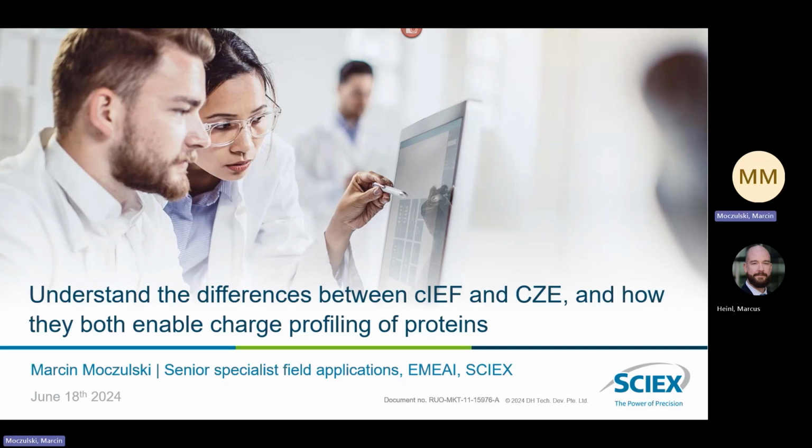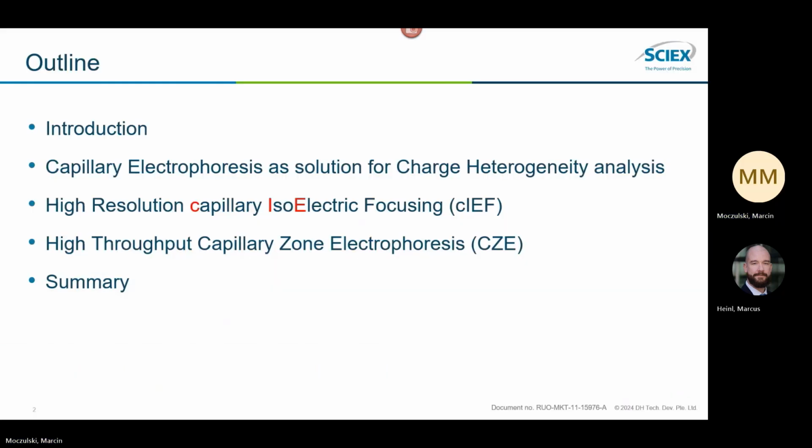Today, I have the pleasure to tell you about differences between isoelectric focusing and capillary zone electrophoresis techniques and how they both enable charge profiling of proteins.